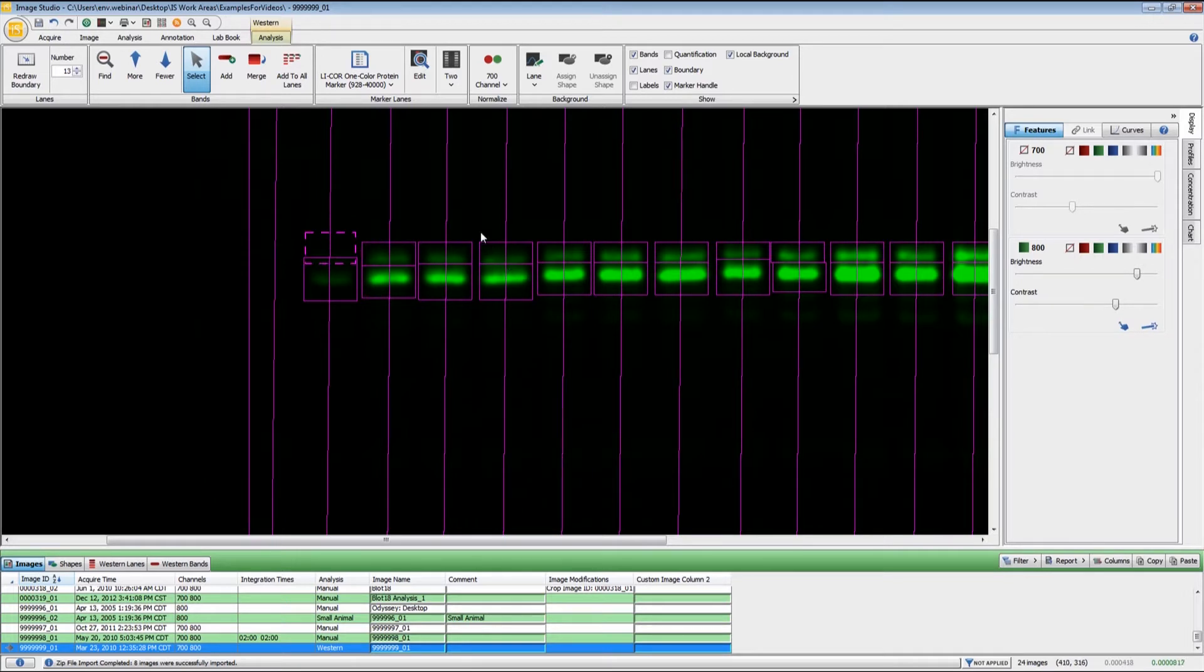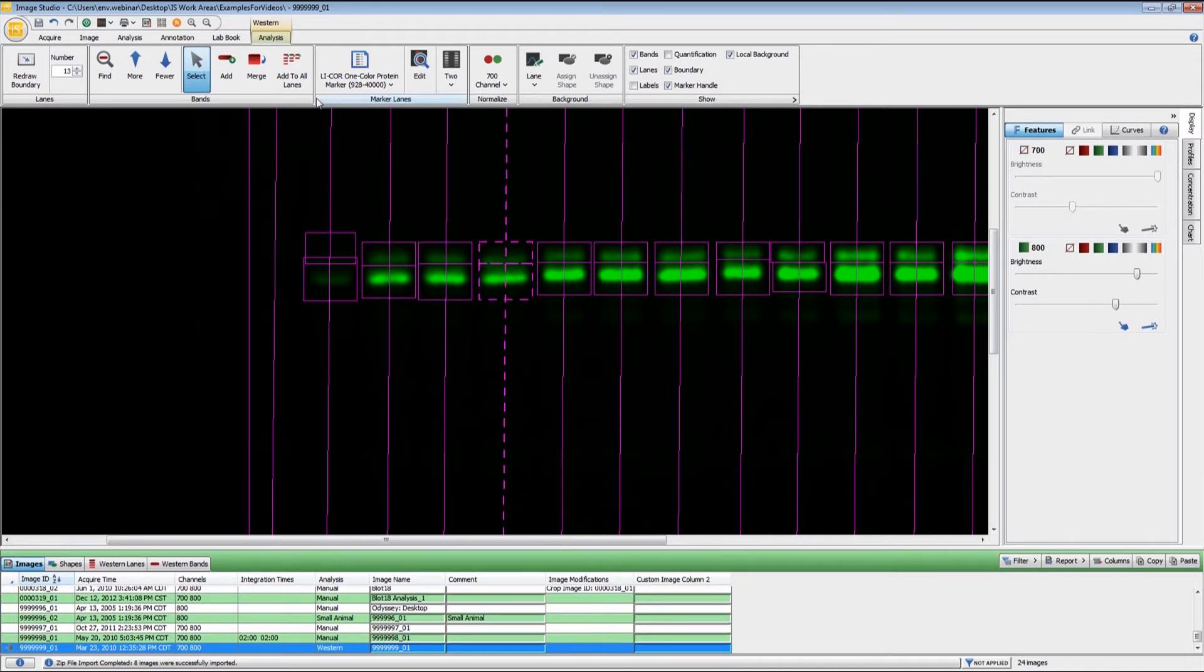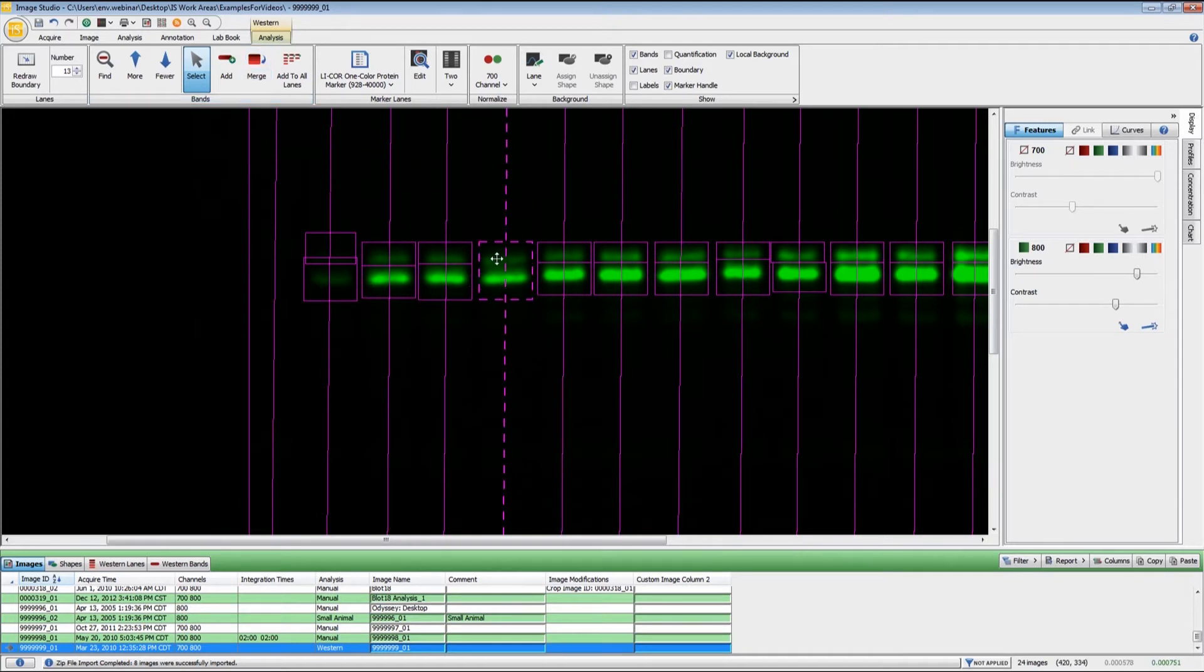If you wanted to have these two bands analyzed as one band, if you highlight both of those, you can click the Merge button and then it turns them into a single band marker.